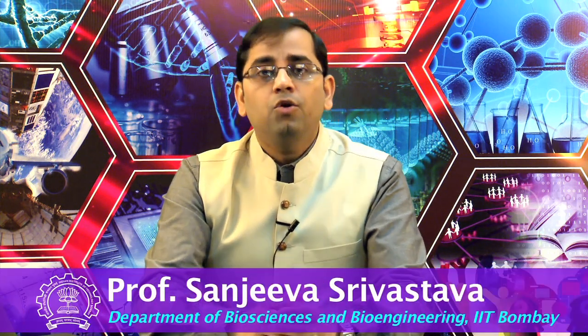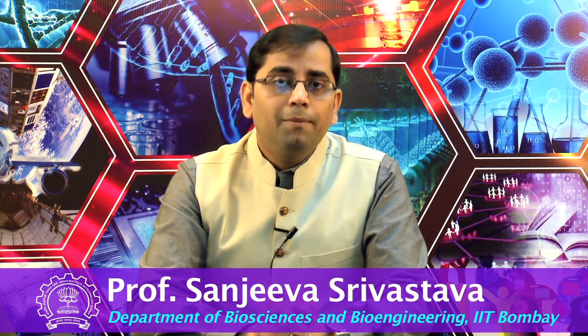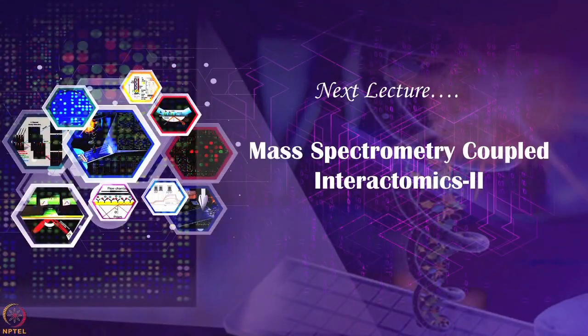Researchers are now looking for ways to improve the accuracy of identifying these interactors drawn from the IP experiment. However, the way mass spectrometry technologies have now become more robust and easy to operate, it is not very difficult to perform immunoprecipitation followed by mass spectrometry experiments. We will give you some basics of mass spectrometry and how to perform these experiments in the next class. Thank you.